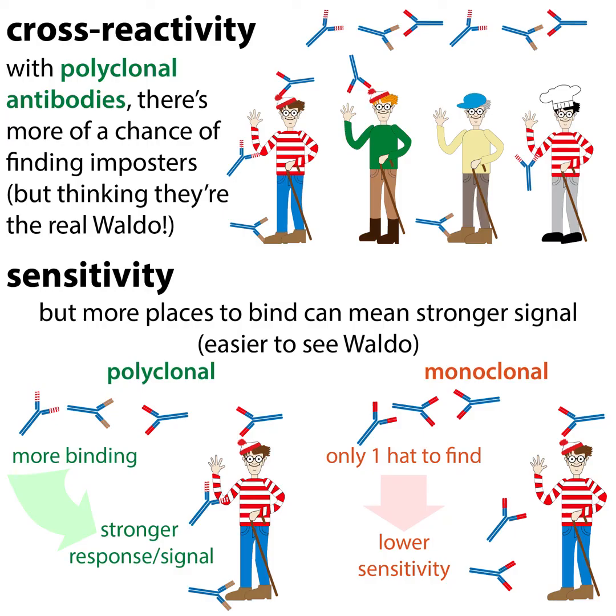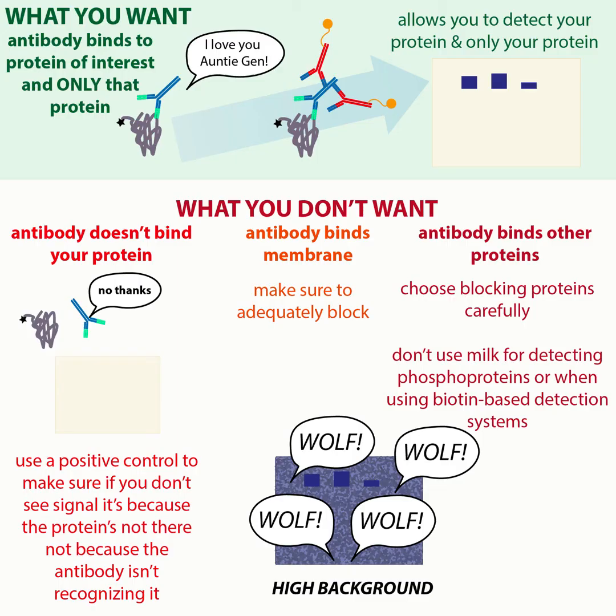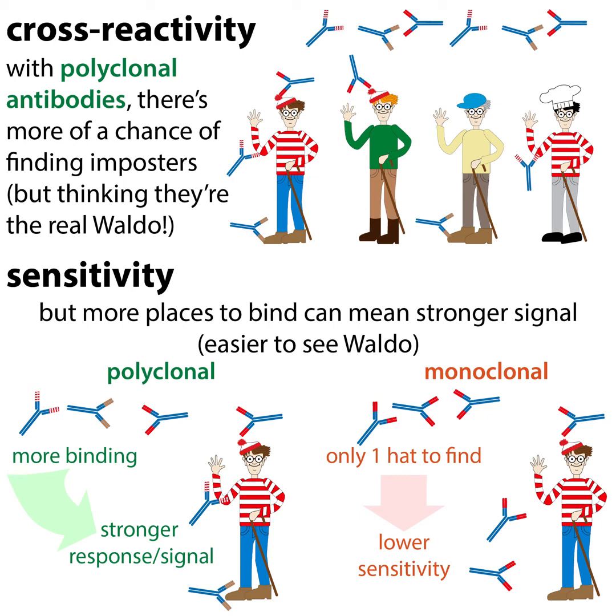Some other things to look out for. Cross-reactivity. This is what we're talking about with the monoclonal versus polyclonal antibodies. If you have polyclonal antibodies, there's more of a chance. That's where you have antibodies that recognize different parts of Waldo. So it's more likely that you're going to recognize other things that also have those parts, or something similar. So you're going to have higher cross-reactivity.